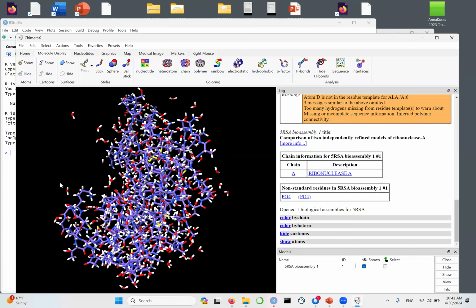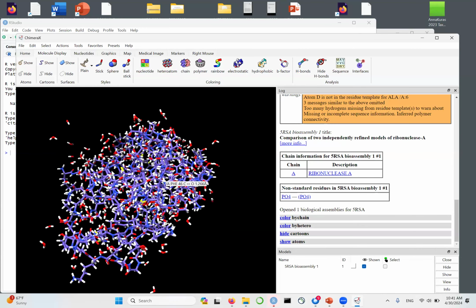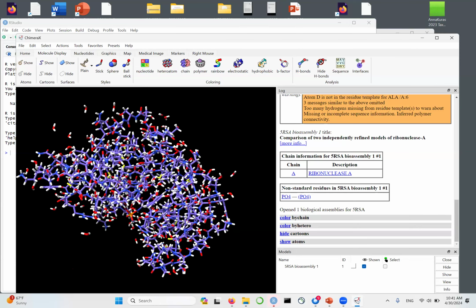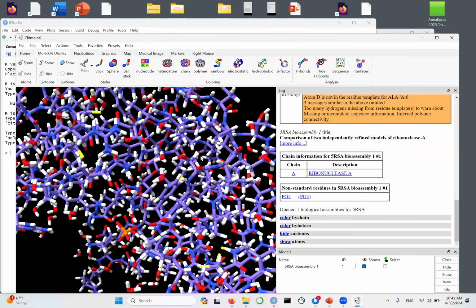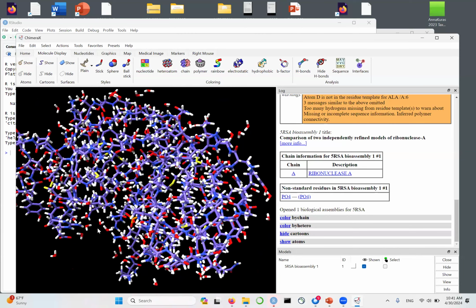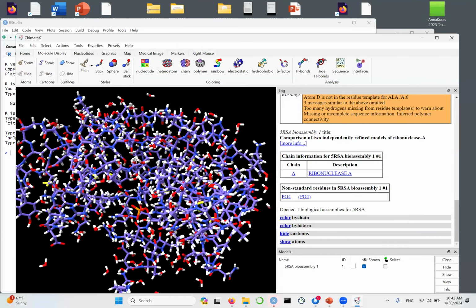This is because in X-ray crystallography, you actually do not see hydrogens. The hydrogens are very small. So a lot of structures determined by X-ray crystallography are missing hydrogens. On the other hand, it will show a lot of water molecules. When I first looked at protein structures, I was surprised that apart from the protein, as you would expect to see in a structure of a protein, you're going to see all those water molecules somewhere here. If you look here, you've got the water molecule. All those V's are water molecules surrounding the protein.